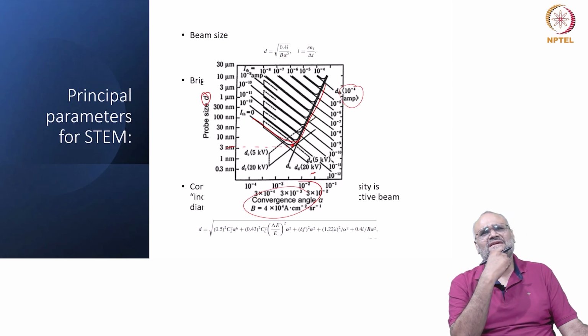People have successfully demonstrated that you can achieve 0.5 angstrom resolution, and even if I am not wrong, there is some modern literature which has been published which states they have achieved 0.3 angstrom resolution as well while imaging in STEM mode. There are of course ptychographic techniques with which you can achieve significantly improved resolution as well.